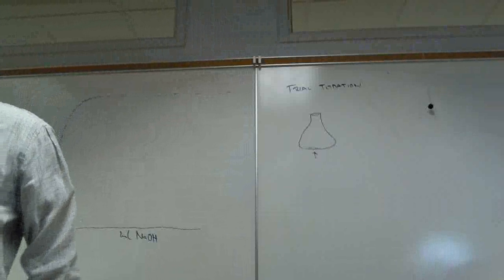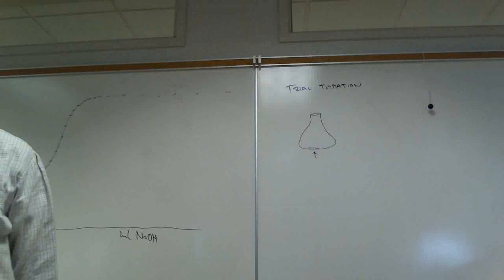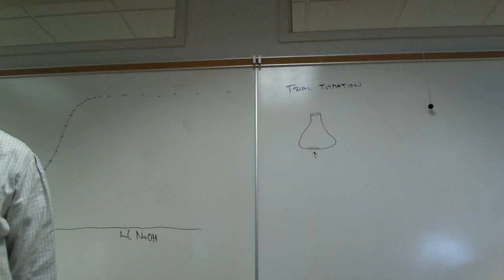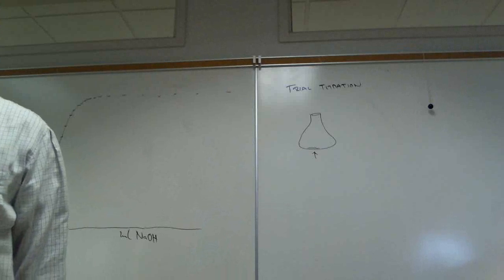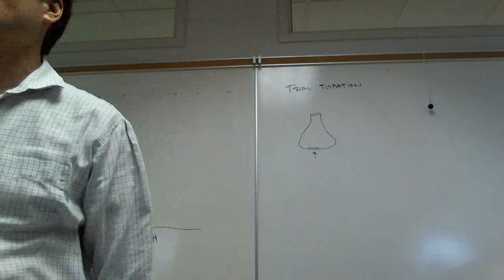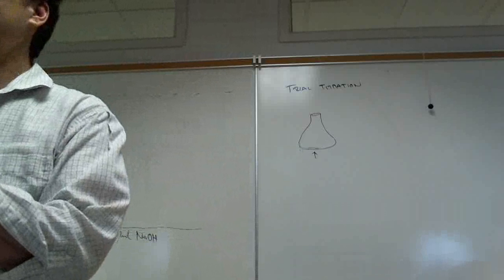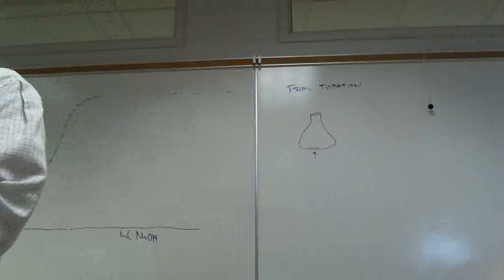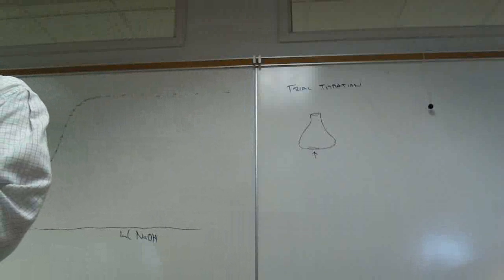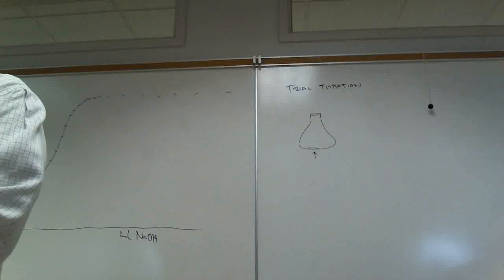What's the problem with too little? The problem with too little is relative error. Relative error is, if you're weighing out a very small sample, then any little error, like a dust particle falling on there, leads to a huge error in your analysis.